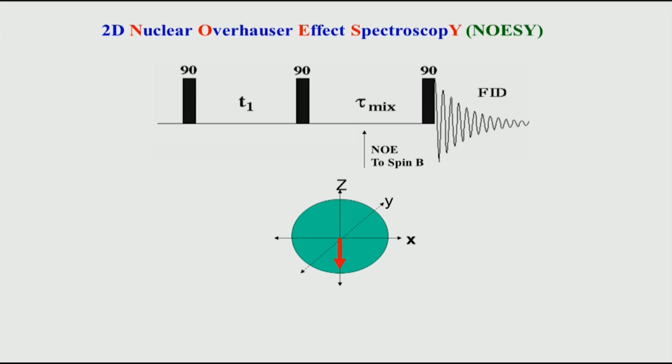But that is not the only way to do NOESY. The typical 2D way, if you want to do a 2-dimensional NOESY experiment, we use what is called transient NOE. That means you are actually inverting the signal of a molecule. Remember, this inversion means we are inverting the population, in a way. So, we have inverted the polarization, and that is transferred to a neighboring hydrogen if it is proximally located. That is how this is done, and that is called transient NOE.